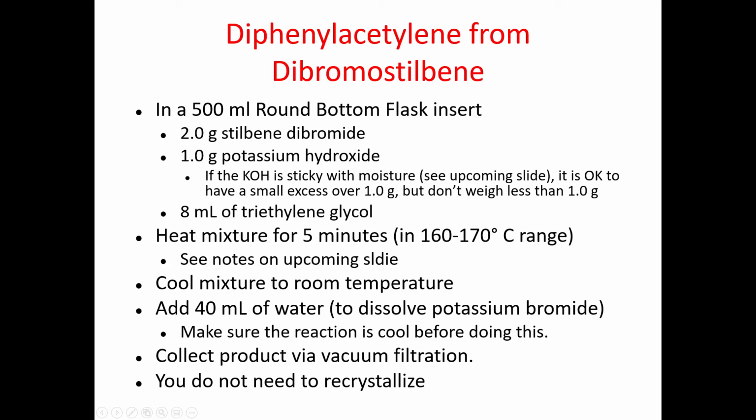So you can see that this is a one-pot reaction where we just add everything into one pot and just let it go. We'll heat up the mixture for 5 minutes around 160 to 170 degrees Celsius. And then after these 5 minutes, we will cool the mixture down to room temperature.